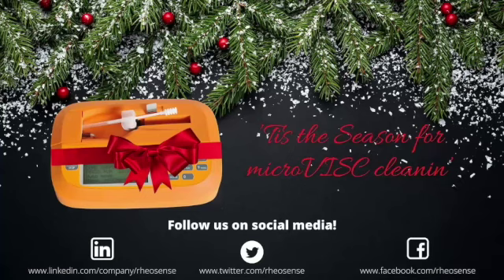All right, so as you can see on the chip cleaning station, we have 3 solvents. Usually for these 3 solvents, you want to do your sample buffer, aqueous, and then you can do acetone or IPA for your drying agents, whichever one's more accessible for you. Right now, for drying, we usually recommend acetone, but we also offer a service where we can help you create your own personal protocols for the chip cleaning station. That way, it's more optimized for your use.